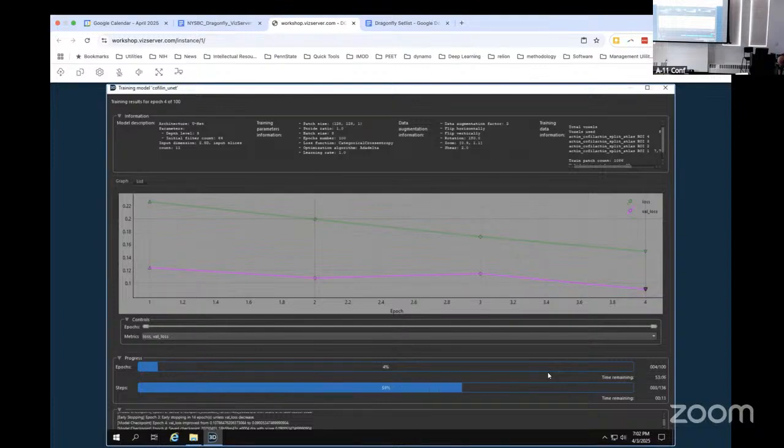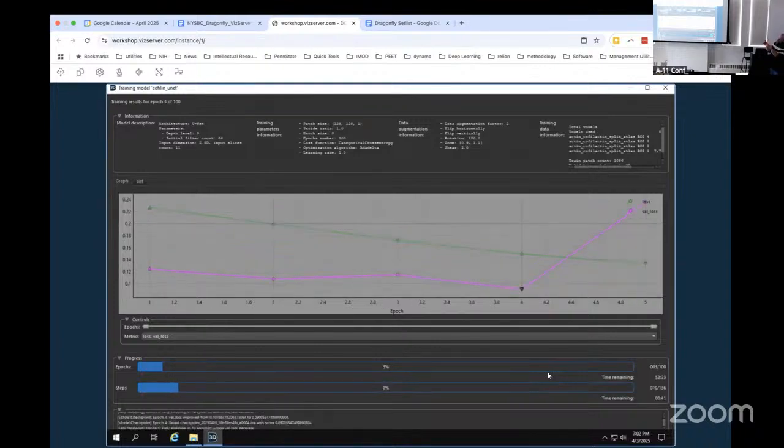I wouldn't do any previews on anything. Just give it an input and an output. You can set it up so you can select an image or a set of your data and say, after each epoch, I want you to segment this and show me the results. So you can actually watch it, in real time, learning the segmentation.